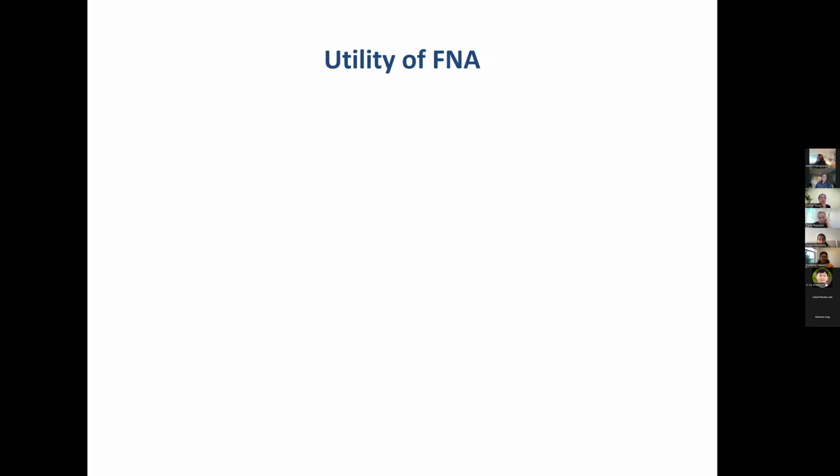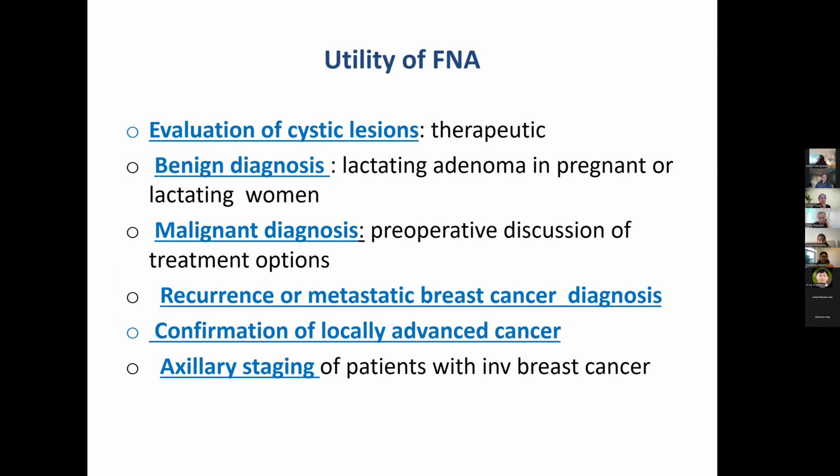So let's talk about some of the utility of fine needle aspiration, which is a more popular method for getting breast aspirates. It's usually used to evaluate cystic lesions, and it can be curative because if you aspirate the cyst and you get just watery fluid, it's probably going to be benign, and the cyst will vanish.